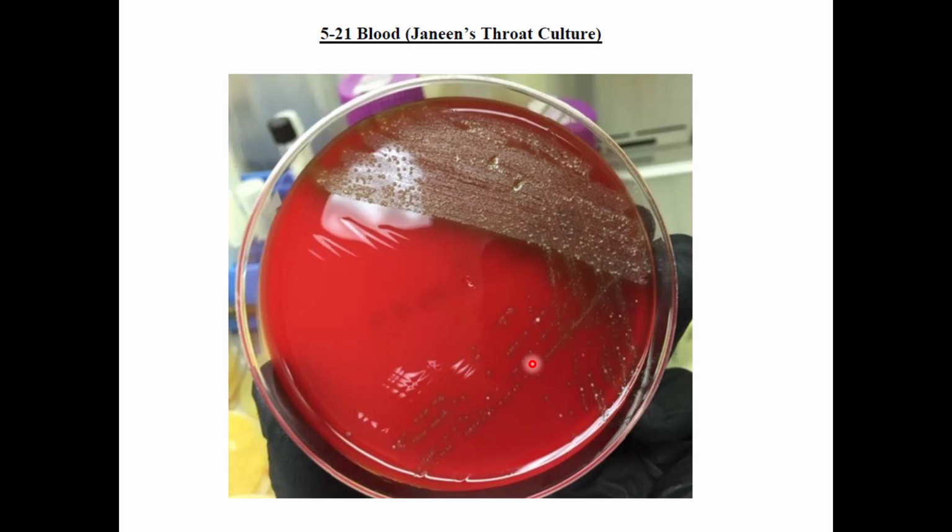They're kind of different from the other ones, to see if any colony would have more of that hemolysis pattern compared to others. And I don't know if you will be able to see here, but there'll be 2 cuts in the center of the plate, and then another 2 cuts over here in the first quadrant.